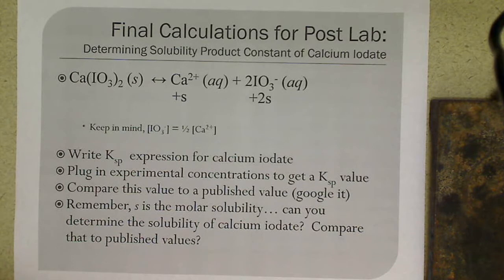So you're going to want to work cooperatively with your partner on using the glassware efficiently. Make sure you label all of your glassware so you know what it is and what solution is in there. And if you run out of glassware, you're going to have to figure out what glassware you can clean up and what waste you can dispose of, so that you can get some glassware to work with.